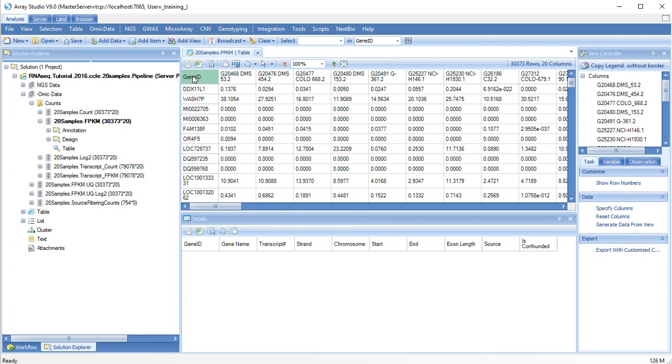Identifying differential usage of isoforms in RNA-seq data can be a tricky problem. A number of groups have proposed relatively complicated methods to identify changes in isoform usage. ArrayStudio uses a straightforward method that we find works fairly well, using ratios of known transcripts in each sample.